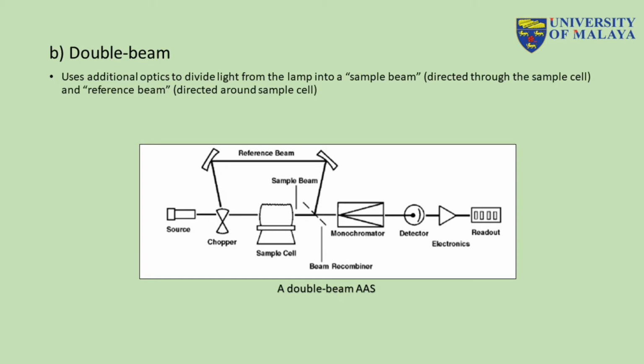In the double beam system, the reference beam serves as a monitor of the lamp intensity and the response characteristics of common electronic circuitry. Therefore, the observed absorbance, determined from a ratio of sample beam and reference beam readings, is more free of effects due to drifting lamp intensity and other electronic anomalies which similarly affect both sample and reference beams.